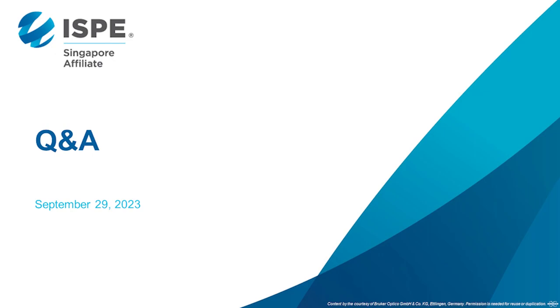Okay, thank you, Mario. There is actually one question now. Comparing IR spectrum by visual, how much deviation can be accepted?